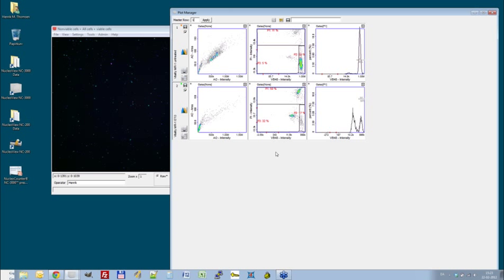So here we have a very quick measurement of healthy versus unhealthy cells, and it's mainly used for quick apoptotic assays because the unhealthy cells tend to also be annexin V positive in most of the cases.